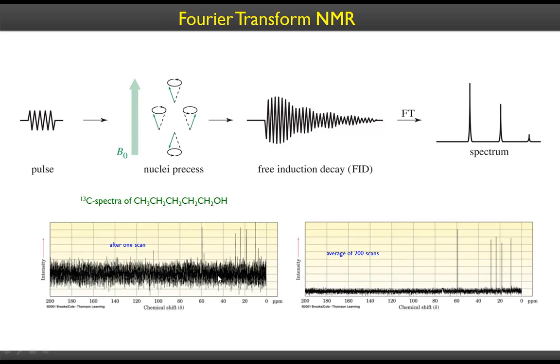And as I said, if you have a 100 milligram sample, after a couple of scans, a couple of minutes, if you stop the experiment and do the Fourier transformation process, you would get a spectrum like this, where the peaks are not as clean as you saw in hydrogen NMR. They are submerged in a very noisy area, right? This is called noise. These are signal. The noise to signal ratio is very high here.